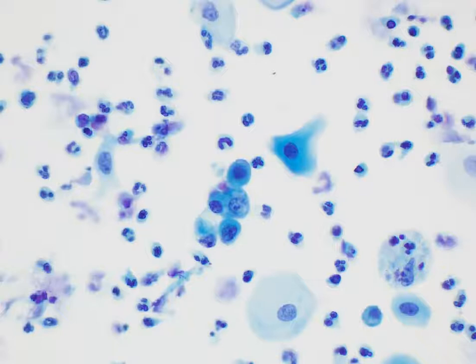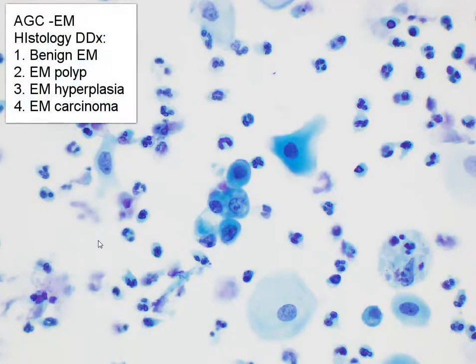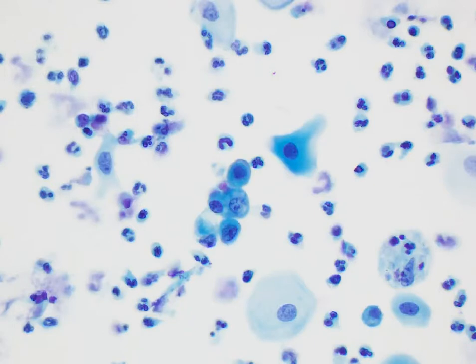Usually we would want to recommend examination of the endometrium, either with a Pipelle or a curettage. Possible outcomes could be benign endometrial cells on histology, endometrial polyps, endometrial hyperplasia, or even endometrial carcinoma.